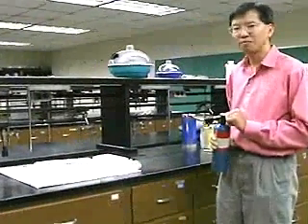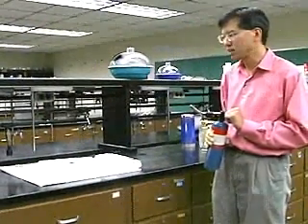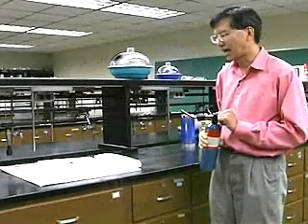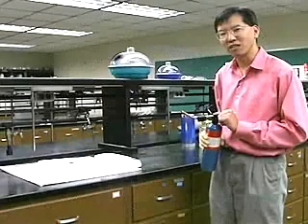Magnesium is an extremely reducing metal and has the ability to give electrons to just about anything. And one of the things that it can give electrons to, believe it or not, is carbon dioxide. So it can reduce carbon dioxide. It can turn carbon dioxide all the way back to graphite. And in the process, the magnesium becomes magnesium oxide, MgO. And that's an example of a redox reaction.